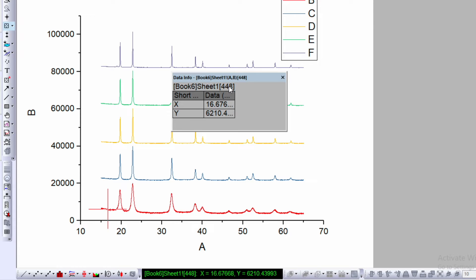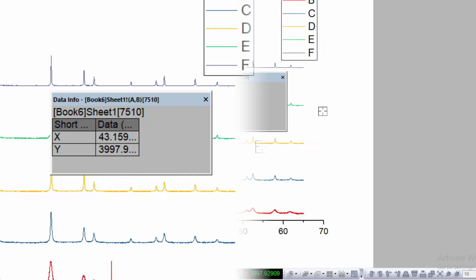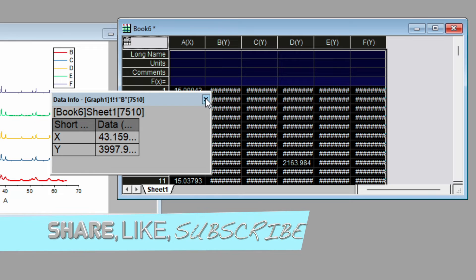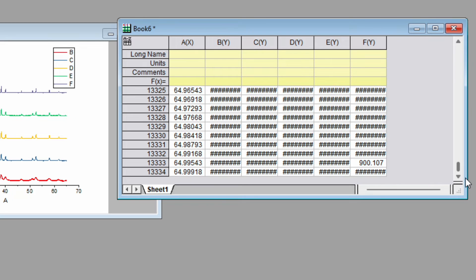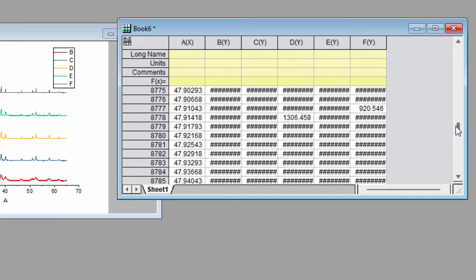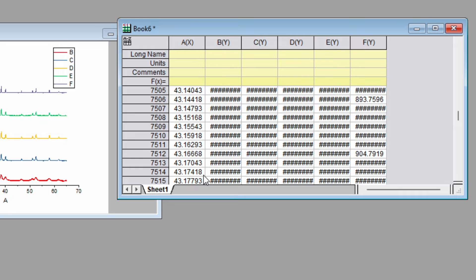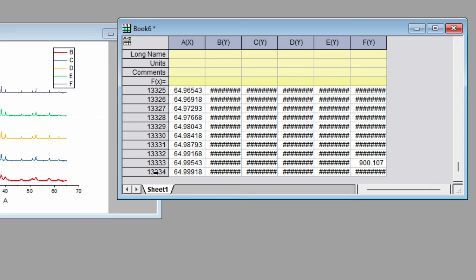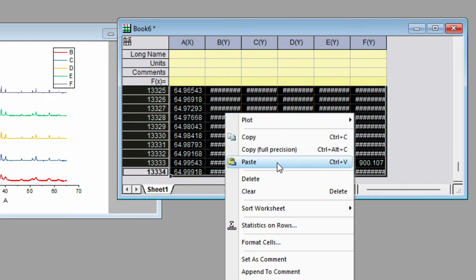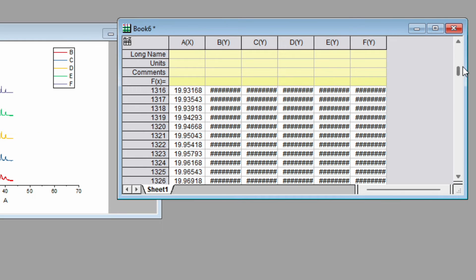Click the Data Reader to inspect data points. I'll choose a book sheet with a starting point of 500 and go up to 7500. Minimize and go back. Right now we have a total of 13,334 data points, but I want to select a limited range — start from 7500, press Shift, select all rows above it, and delete them. We don't want those in the 2D plot.